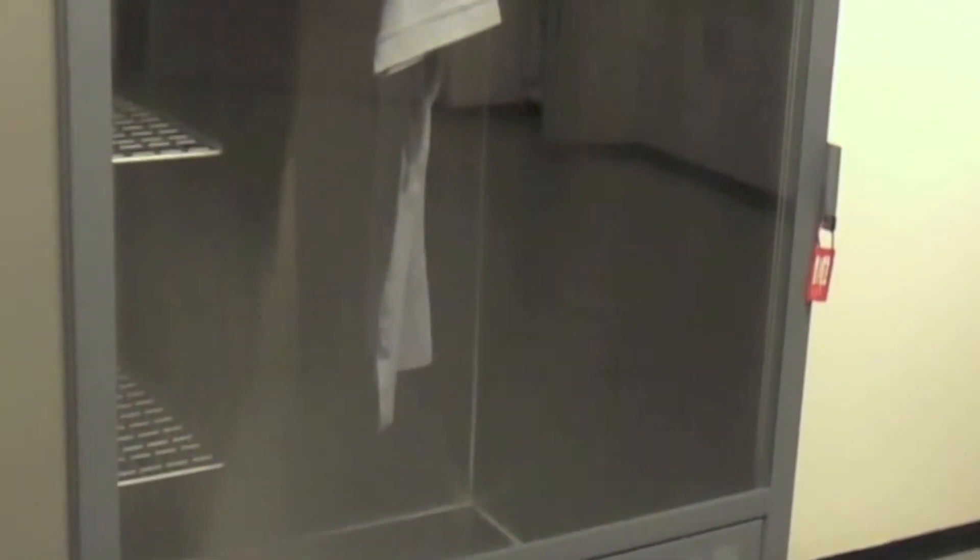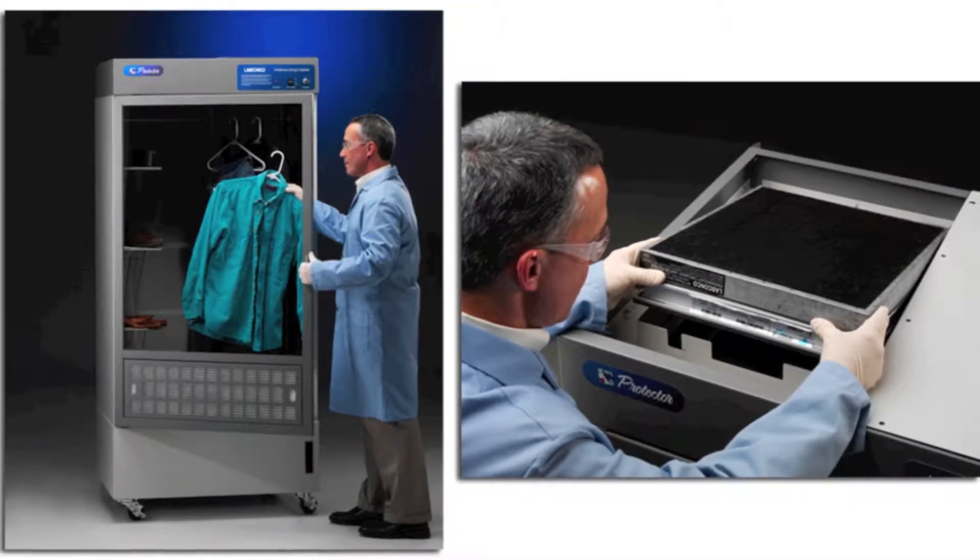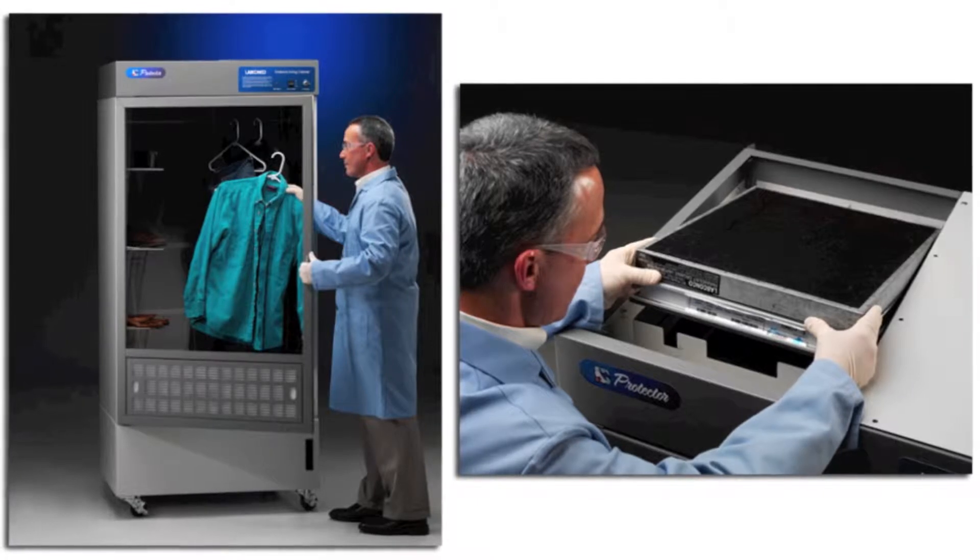The pre-filters help prevent contamination of the drying evidence. The HEPA filter protects end users from potential biohazards, while the carbon filter removes nuisance odors.